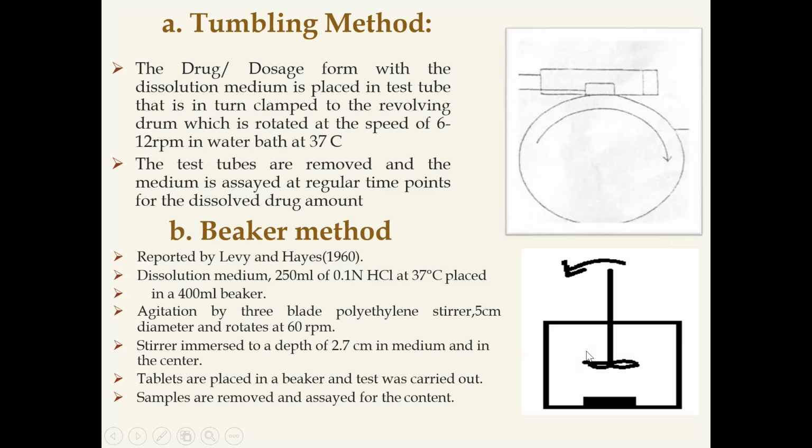So after adjusting all these conditions, tablets are placed in the beaker and the test is carried out. At specific time intervals, take the samples from the beaker and assay for the content. This is about the beaker method.